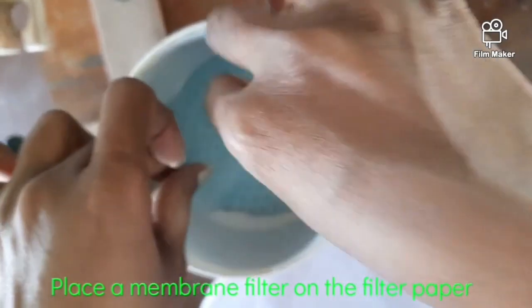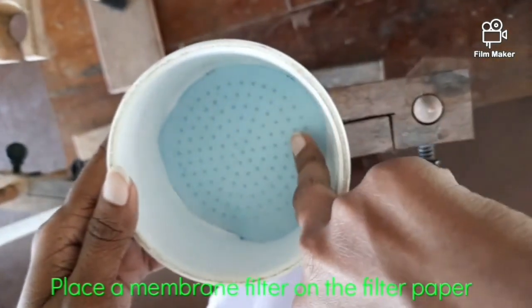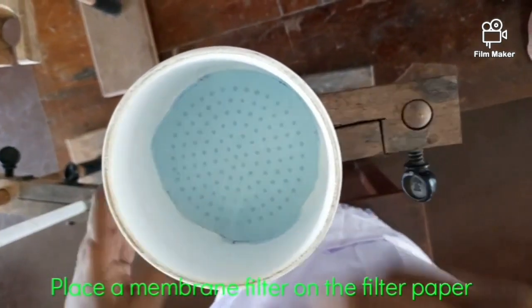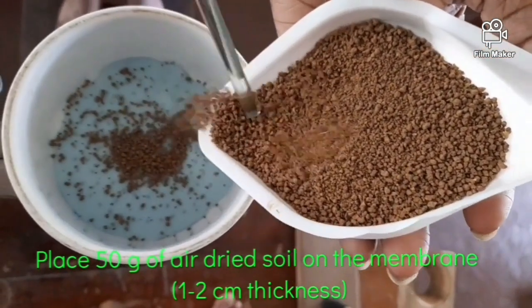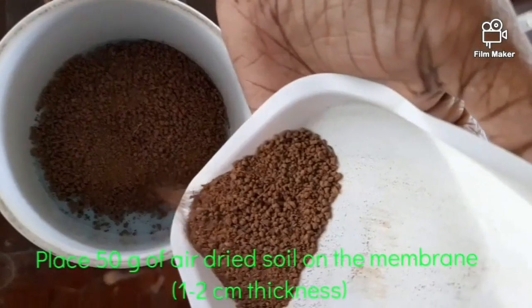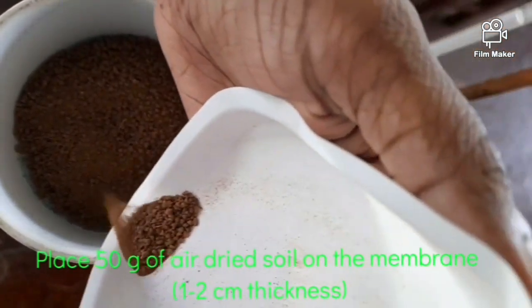Next, place a membrane filter on top of the wetted filter paper. Then, add 50 grams of soil on the membrane filter evenly. The thickness of the soil layer should be 1 to 2 centimeters.